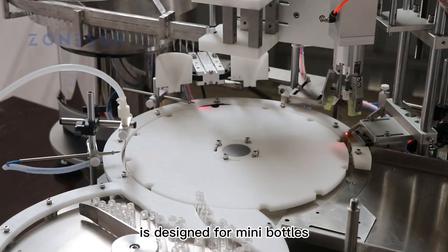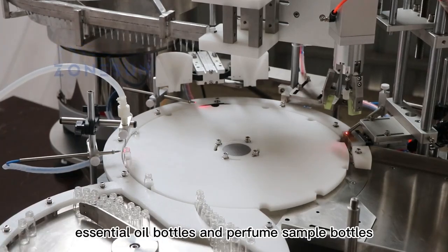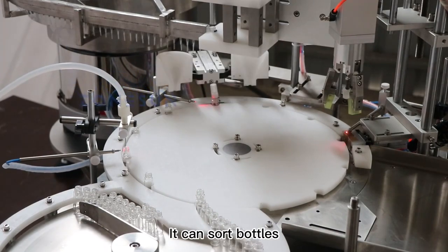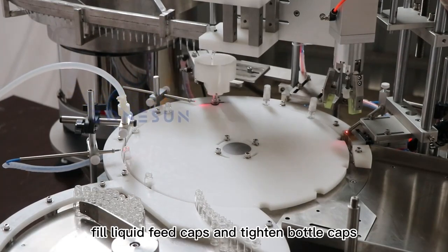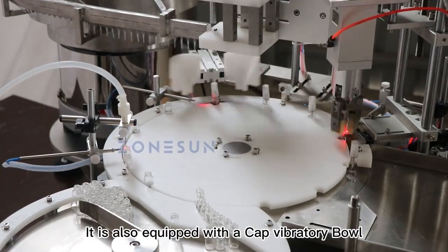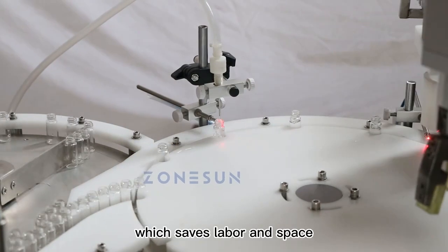This filling capping machine is designed for mini bottles like eyedrop bottles, essential oil bottles, and perfume sample bottles. It can sort bottles, fill liquid, feed caps, and tighten bottle caps. It is also equipped with a cap vibratory bowl sorter, which can fill liquid automatically, saving labor and space.